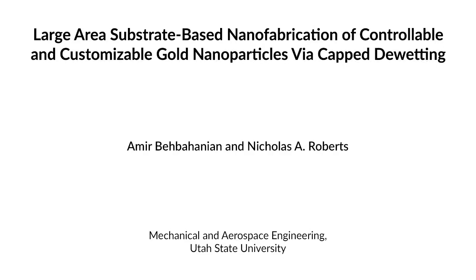Our protocol provides a technique to customize nanoparticle distribution fabricated on a substrate by changing the dewetting dynamics without changing the material thickness. Our technique is simple, yet still provides a range of particle sizes. Other techniques out there require extensive lithographic steps to provide the particle control.